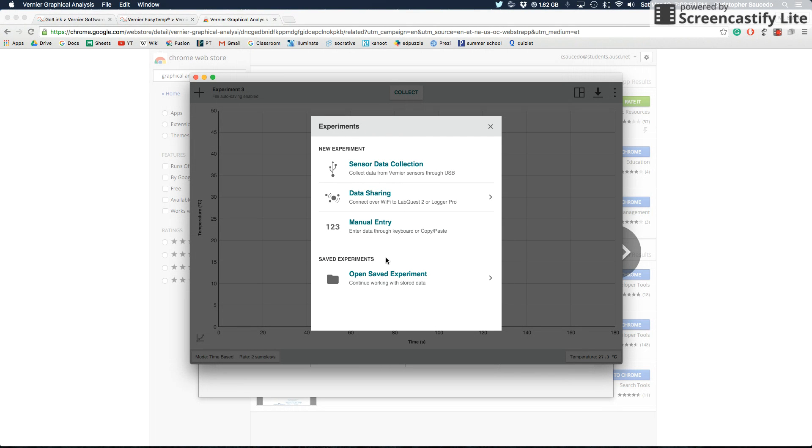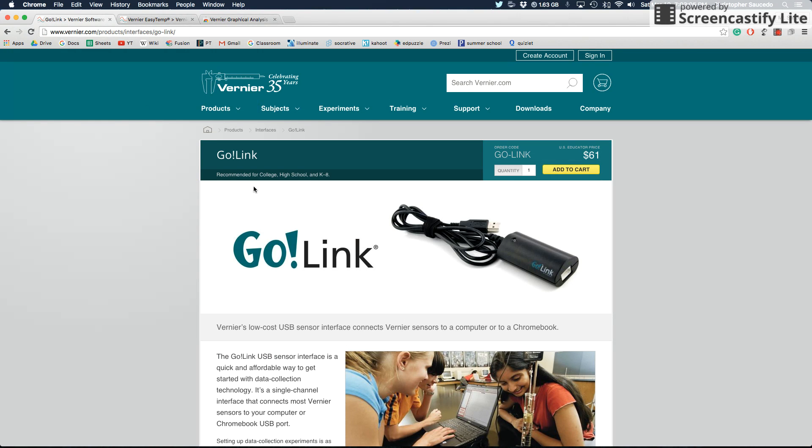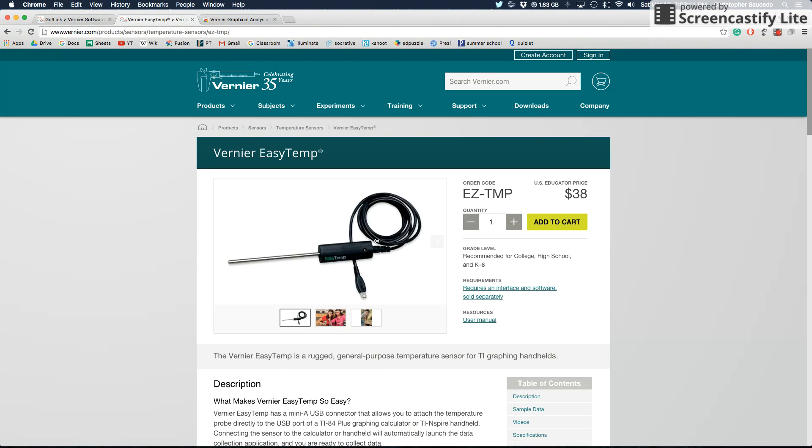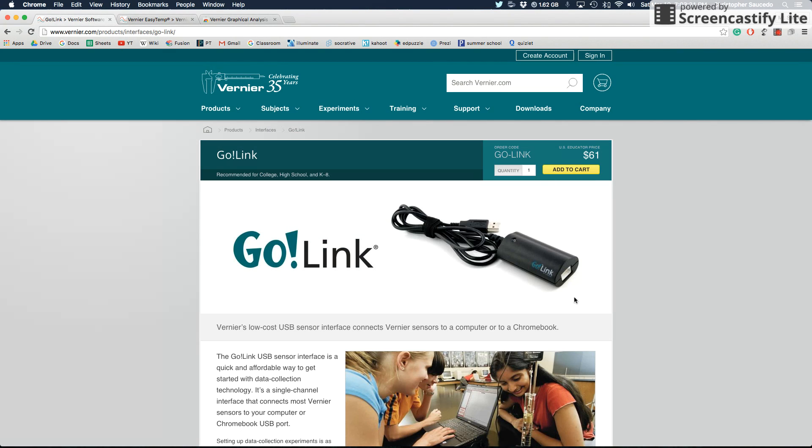Graphical Analysis has a couple of different settings first. Don't click on anything until you've plugged in your temperature probe to your Chromebook. You'll have two parts. The GoLink cable gets plugged directly into the USB port of your Chromebook. And then the temperature probe has a little white, almost like an Ethernet cable port, that you plug into the GoLink cable.